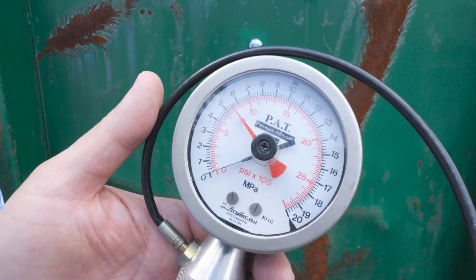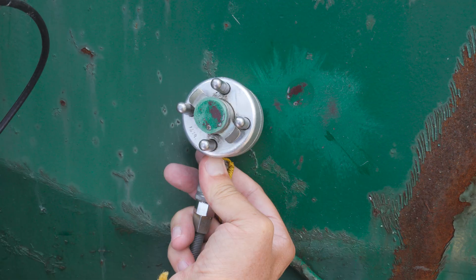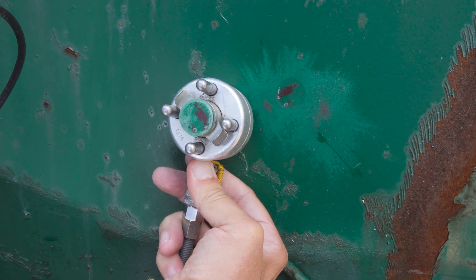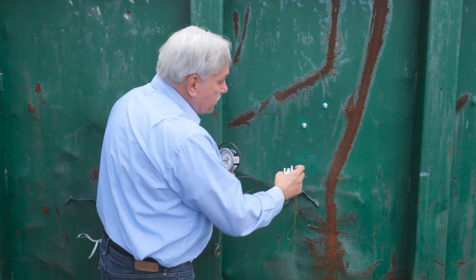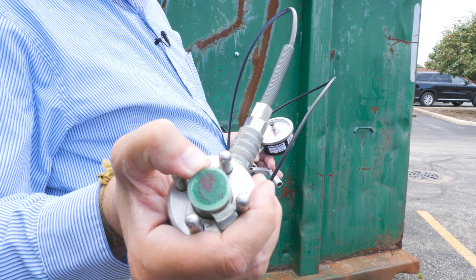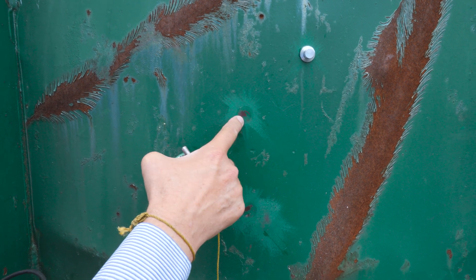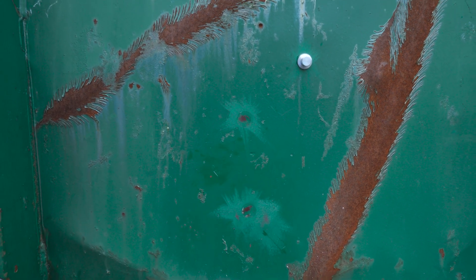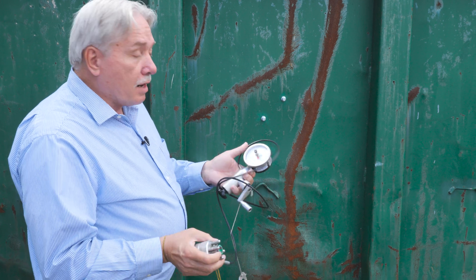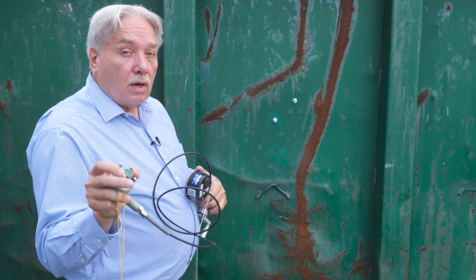We get two things out of this. One is the stress reading — this one came off at 800 psi. We also get information from the dolly about where the weakest plane of failure was. We can see that about 80% came off between our green coating and the other 20% came off between a brown primer. So we collect not only what the stress is but also how it fails.